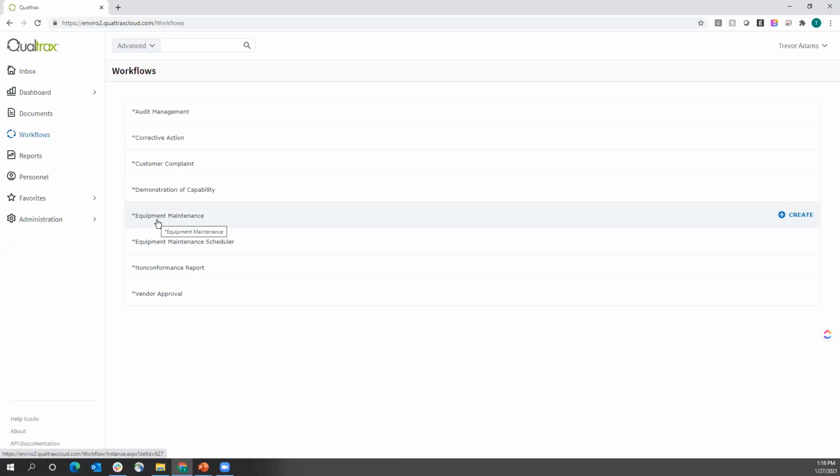Your end users are only ever going to see the ones that they directly interact with, right? If I'm an analyst, maybe I see the equipment maintenance and the non-conformance report, right? Those are the only ones that are relevant to my job. Now, again, that's going to work everywhere in Qualtrax. So when I log in, what I see is dependent on what I need to interact with. Okay.